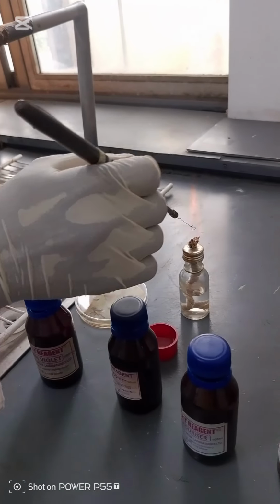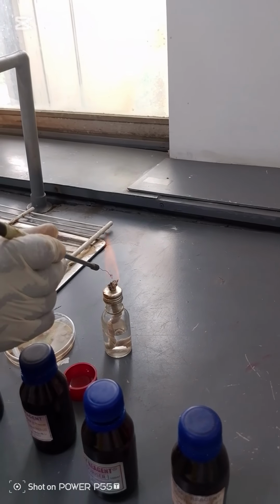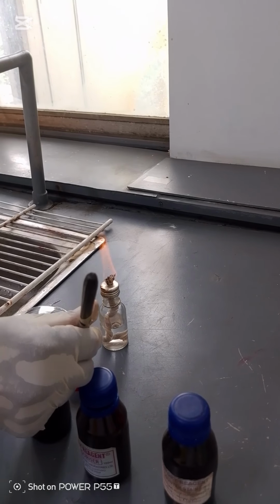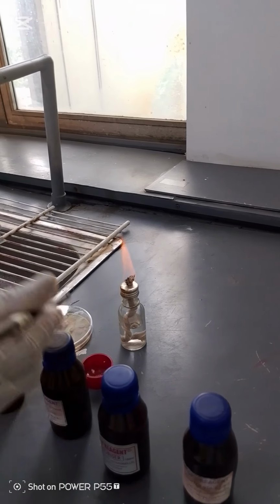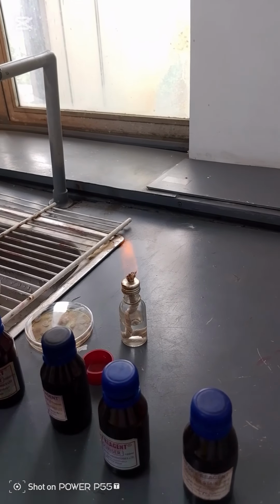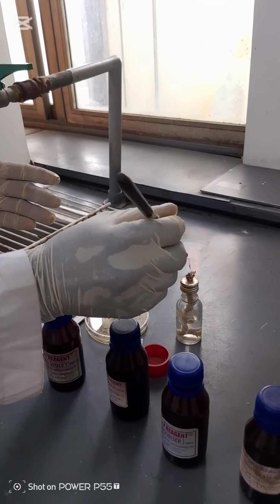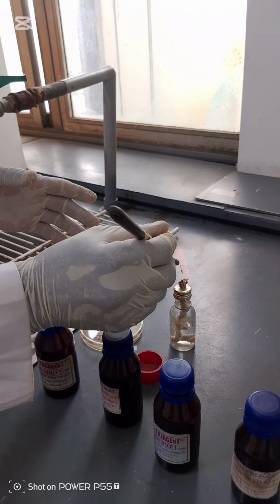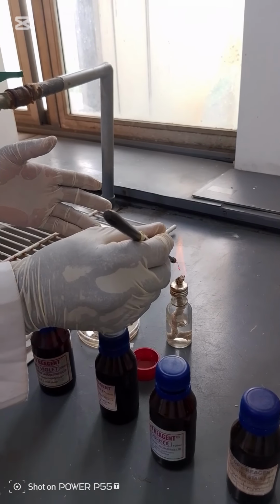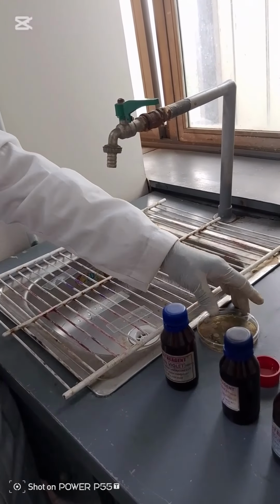First, we sterilize our inoculating loop in direct flame until it's red hot. Then we cool it and put a drop of sterile water on our slide. Then you flame again. At each stage you have to flame your inoculating loop to avoid contamination or introduction of foreign organisms. After flaming, you cool your inoculating loop so that you don't kill the organism.